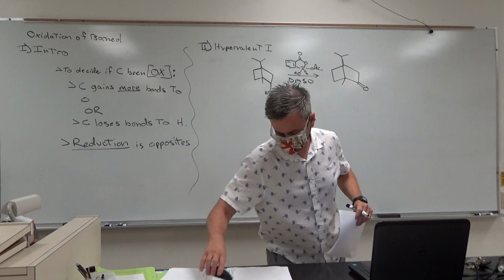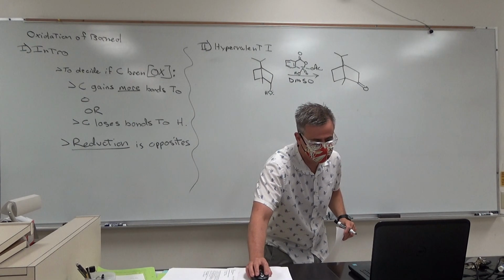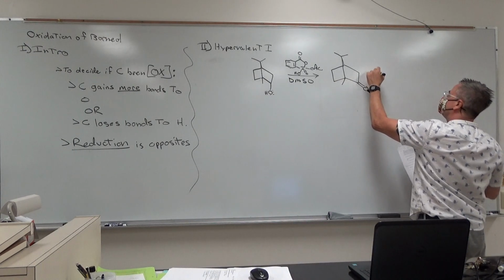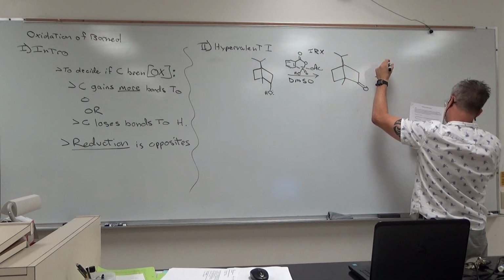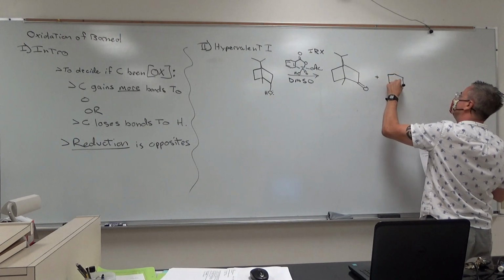Sorry. Shut off this noisy thing. And then the IBX, this is IBX. And it gets turned into this compound.